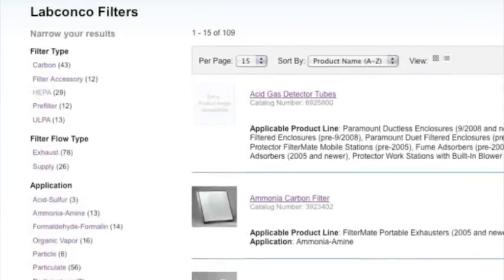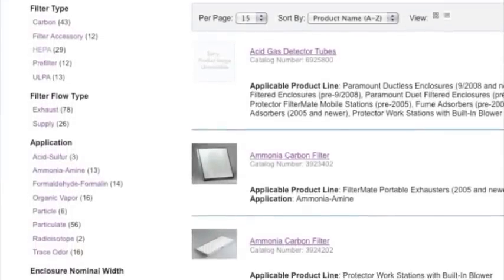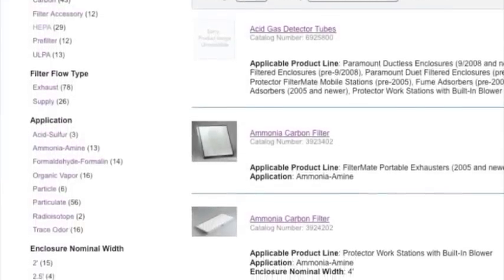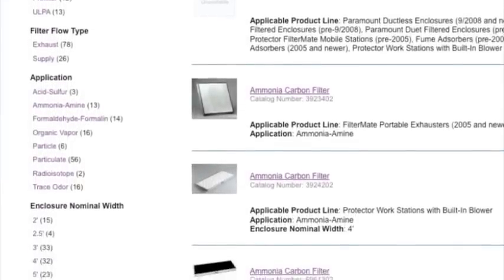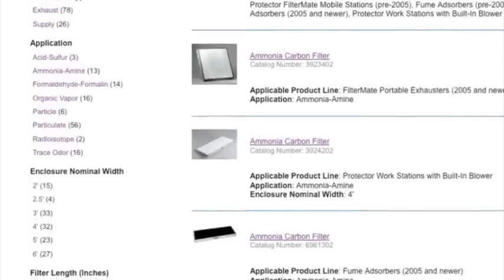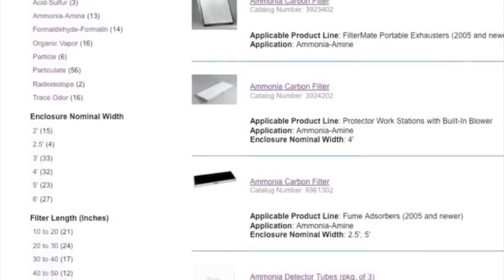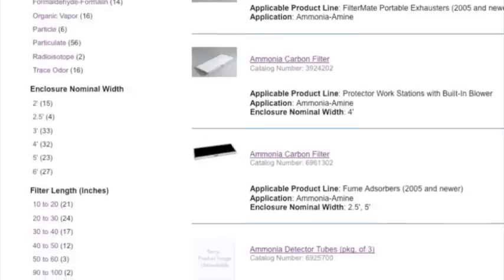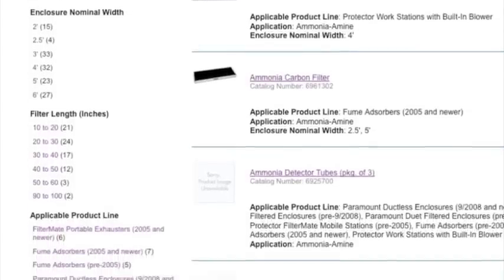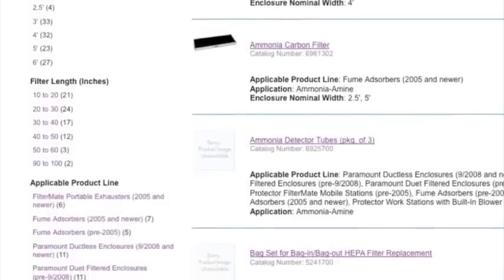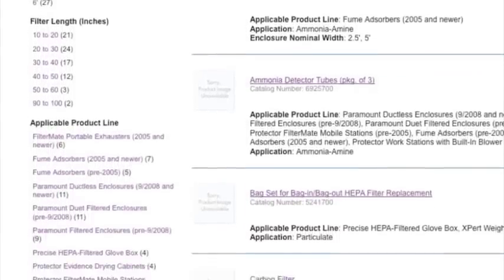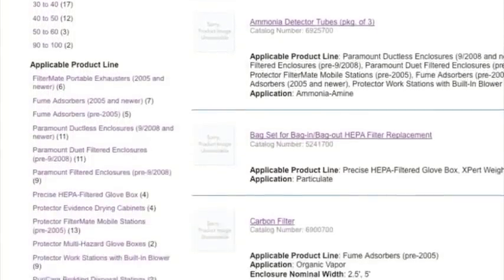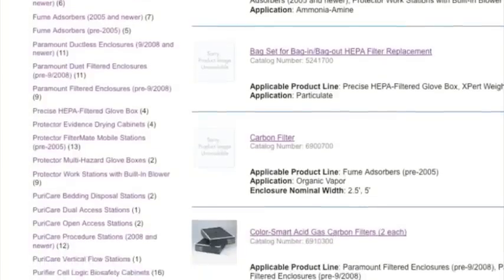The LabConco filter wizard offers six sets of searchable criteria located in the left-hand column on the page. These criteria include filter type, filter flow type, application, enclosure nominal width, filter length, and applicable product line.